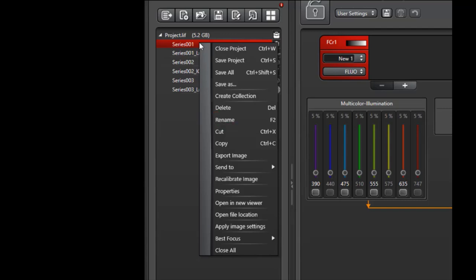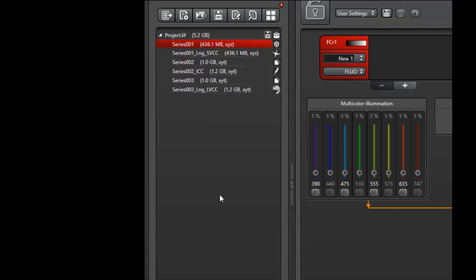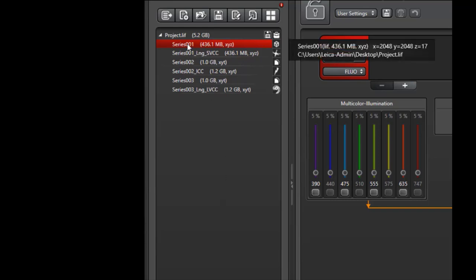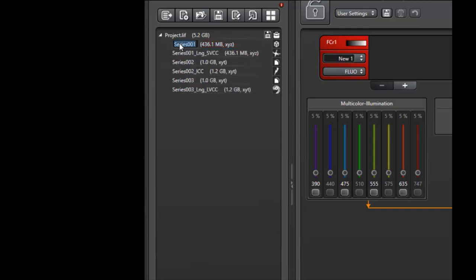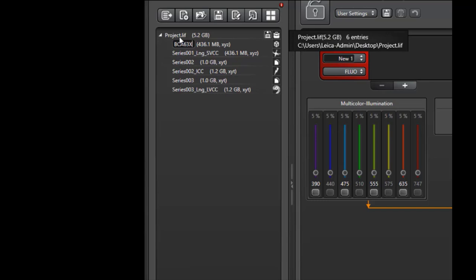Let's go through a typical example. I've identified series 001 as a promising data set and want to give it a different name to more accurately describe the experiment. In this case, I will call it BCA63X for the cell line and the magnification. To rename any of these images, I can do so by right-clicking and selecting Rename. Alternatively, I can click the image, type in BCA63X, and now I can easily reference that file at a later date.